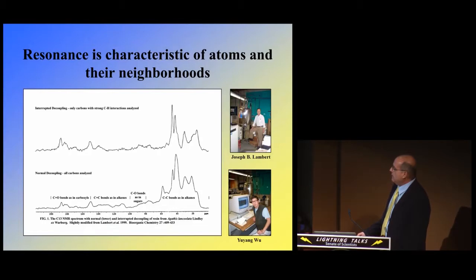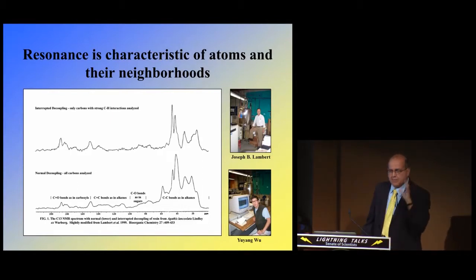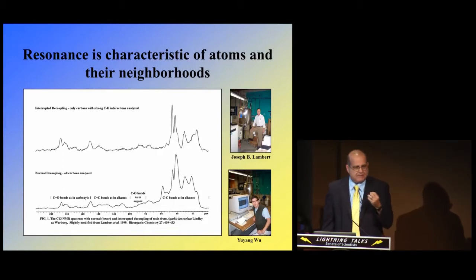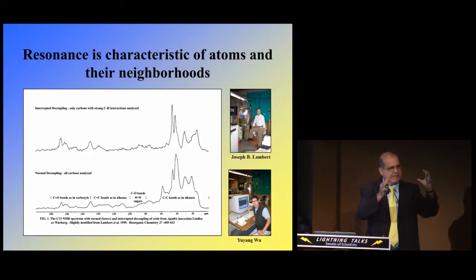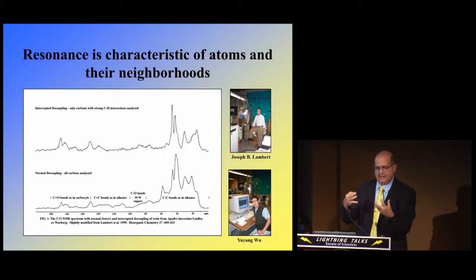Depending where the peak is located along the horizontal axis, that's the basic module of exudate that we have. And when I say module, the implication is that we do not have, contrary to mass spectroscopy, chemical composition. We just have modules, basic building blocks, kind of like a Lego toy.